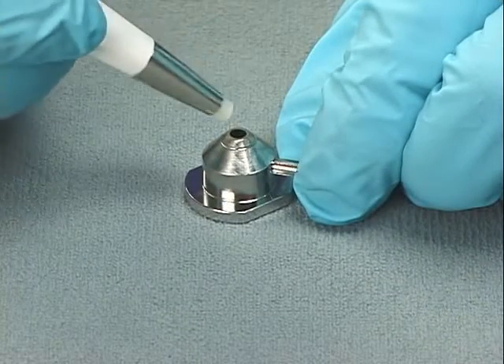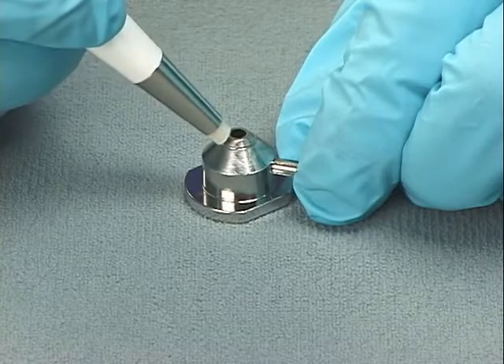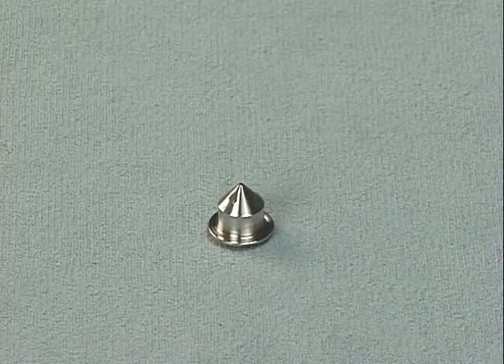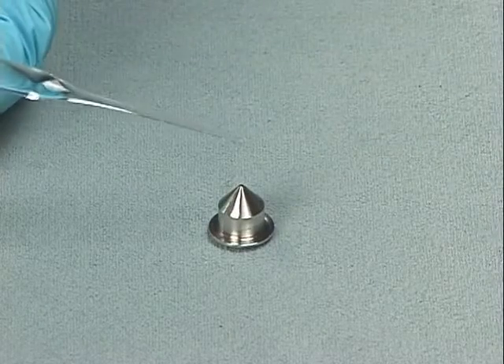Using a glass fiber pen, gently rub the surface of the cone gas nozzle to remove gross contamination. If the sample cone contains debris, place a drop of formic acid on its orifice.